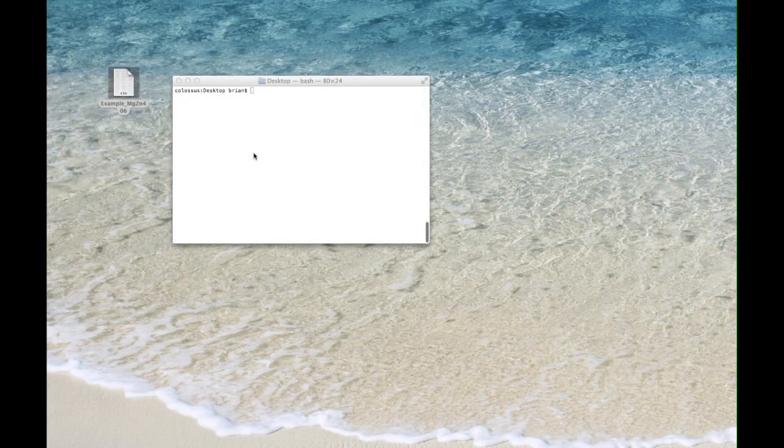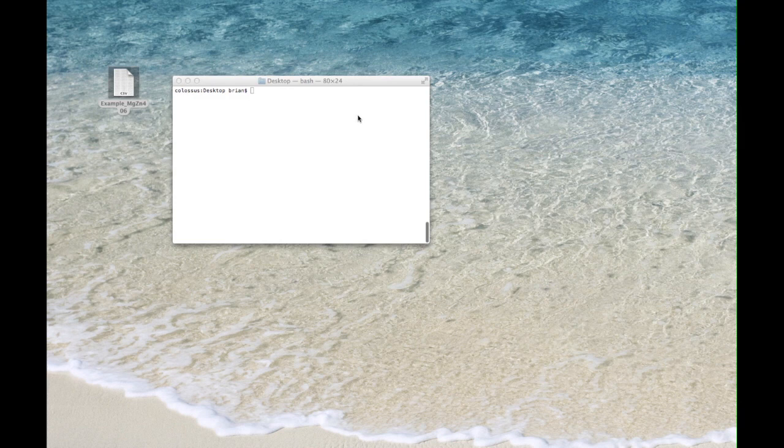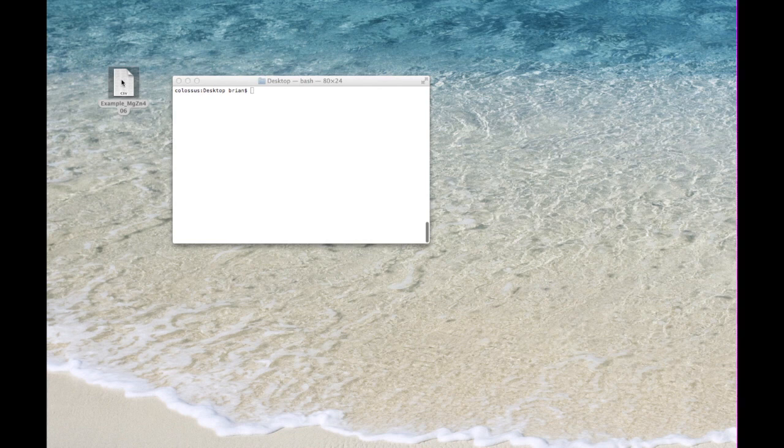Now here on my desktop I have a terminal window from which I will start the graphical user interface. You can also start the graphical user interface from the executable as you can download it from the internet. And over here I have my dataset.